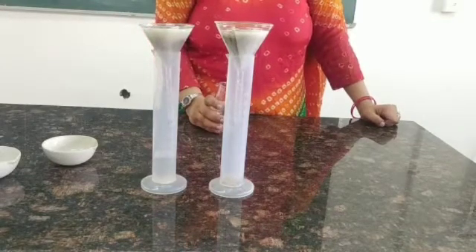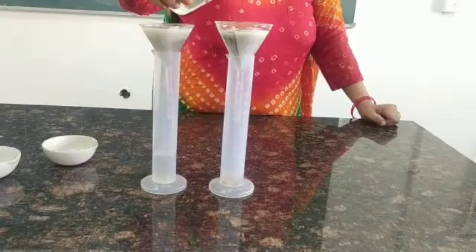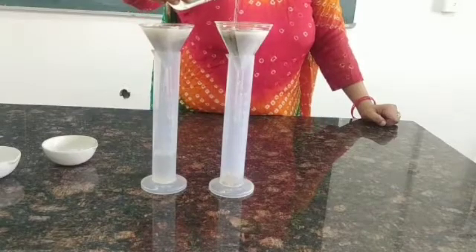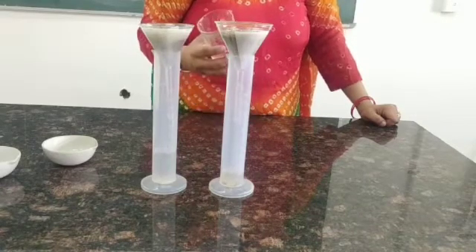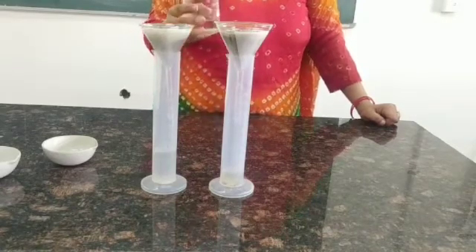Once the water starts to drip down, we are going to leave this setup for some time — at least for 10 minutes.